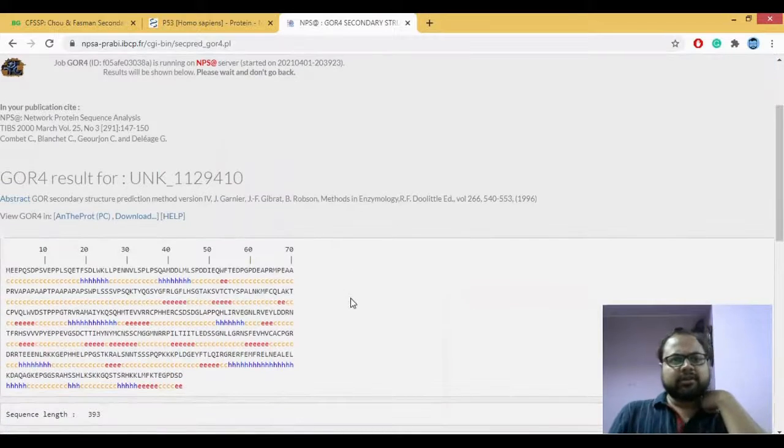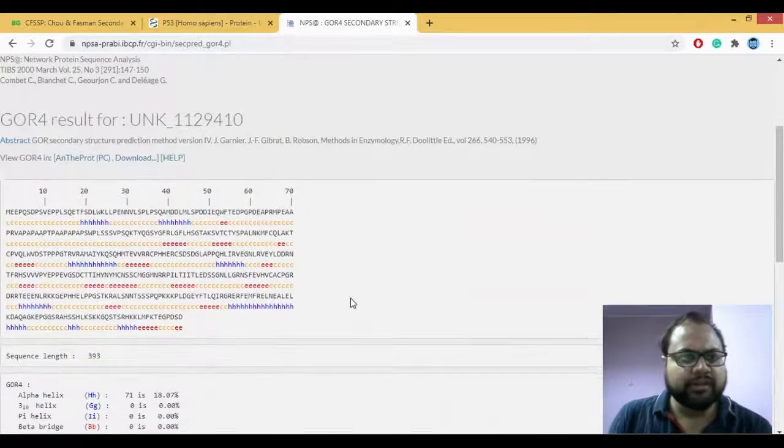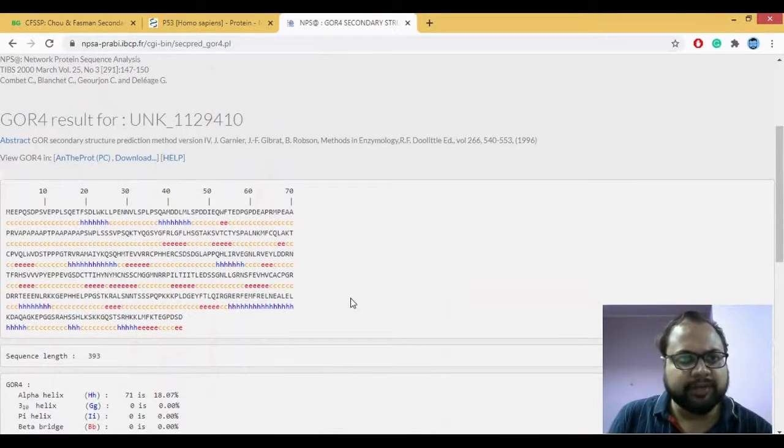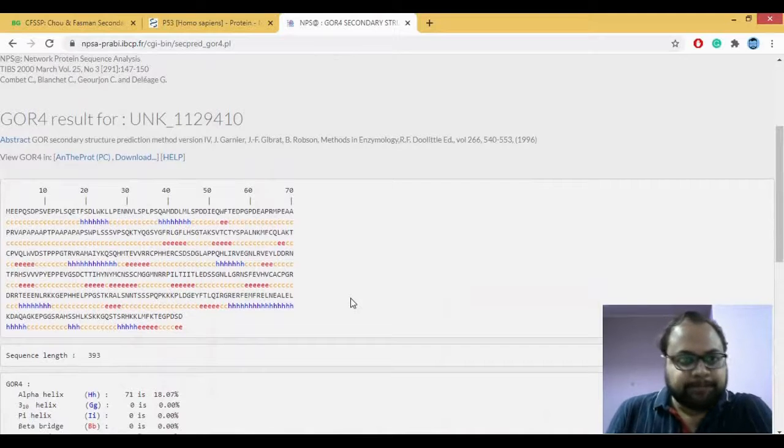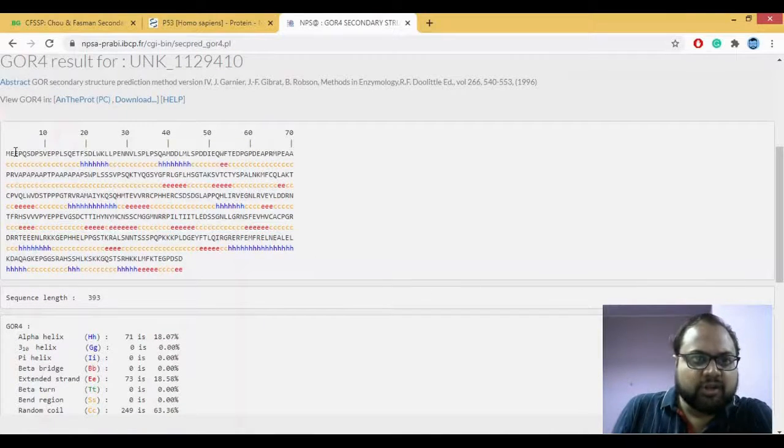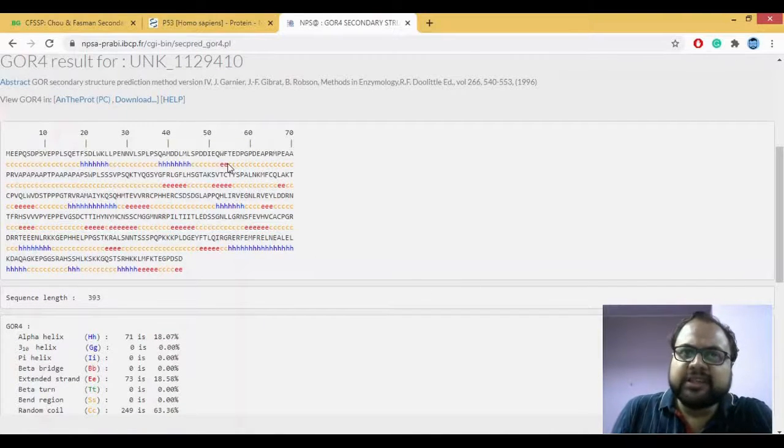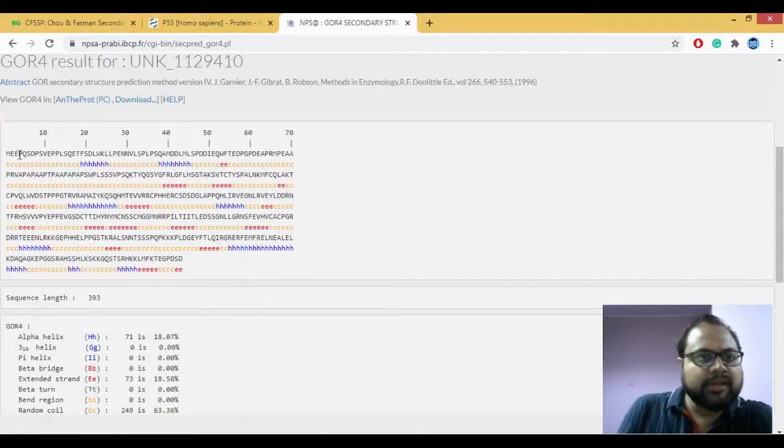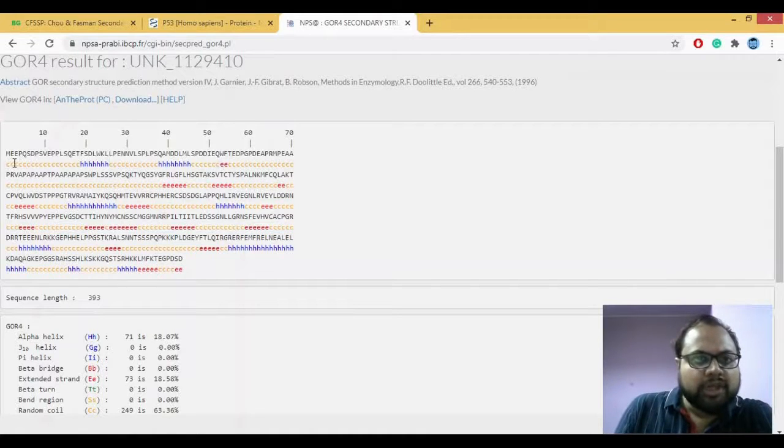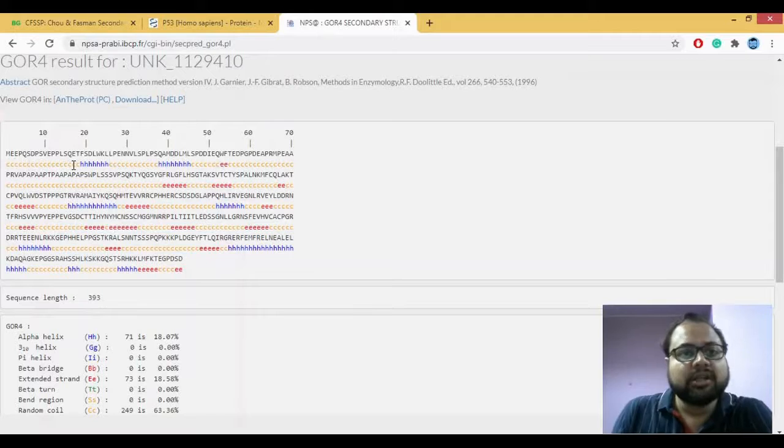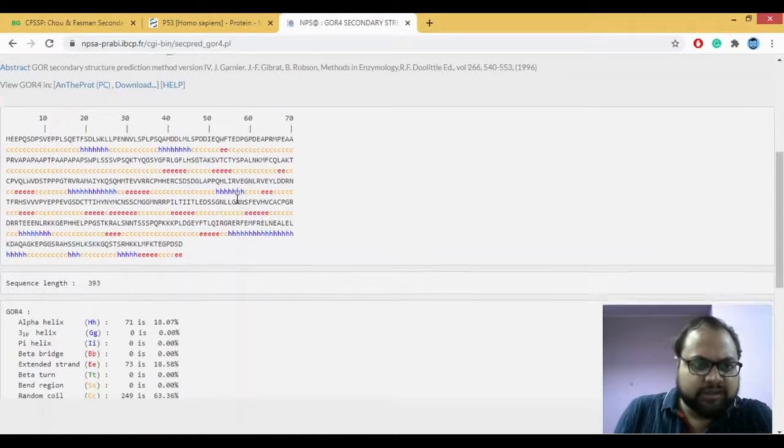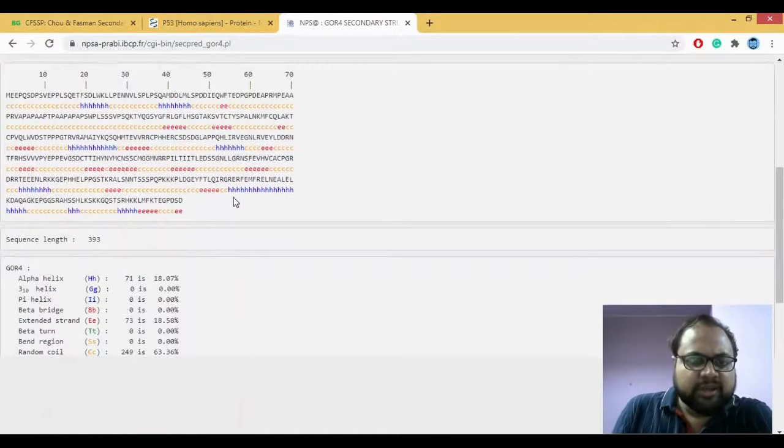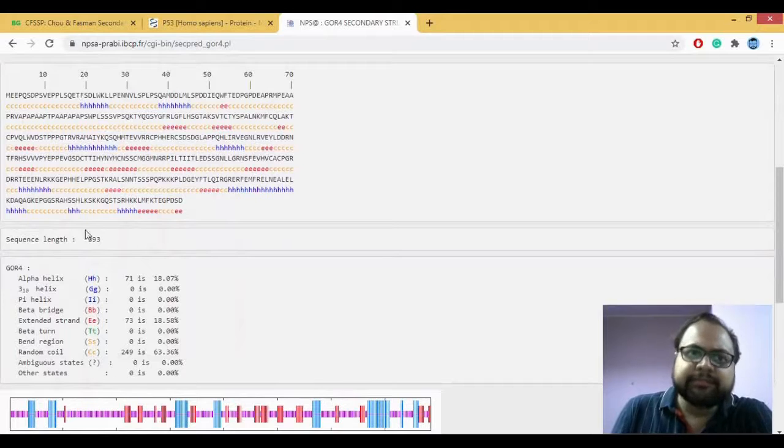I quickly got the results. It does not take a lot of time. So this is your query sequence which you have incorporated and below you can see that it has predicted whether it is GOR4. Now let's look at this section here.